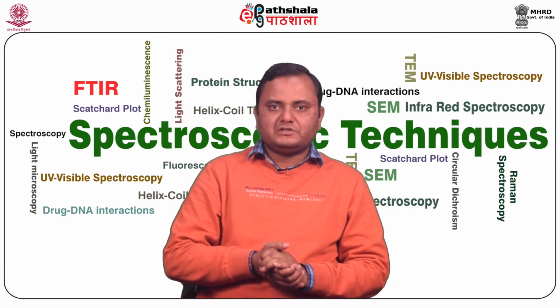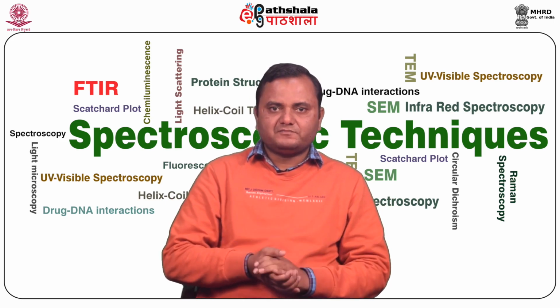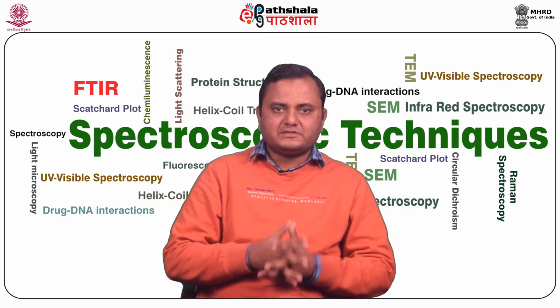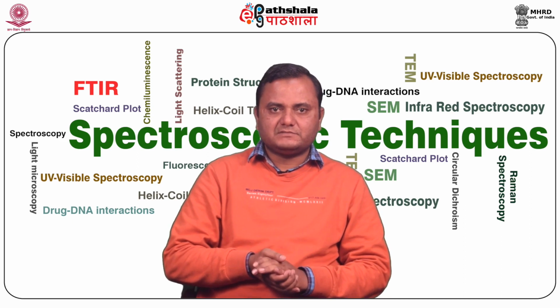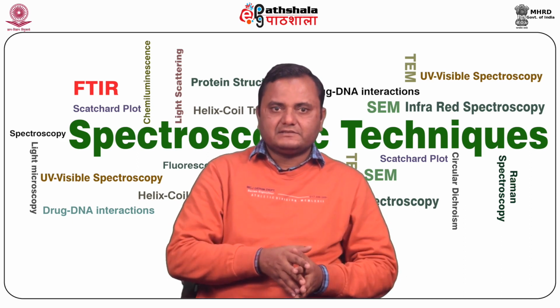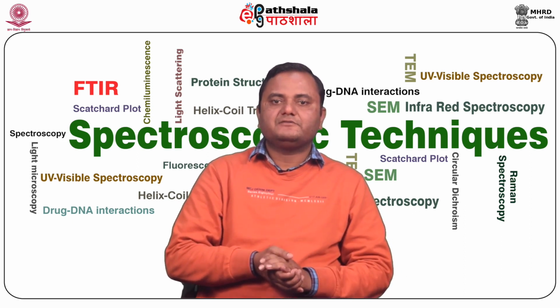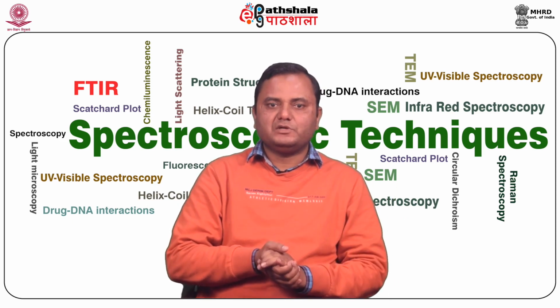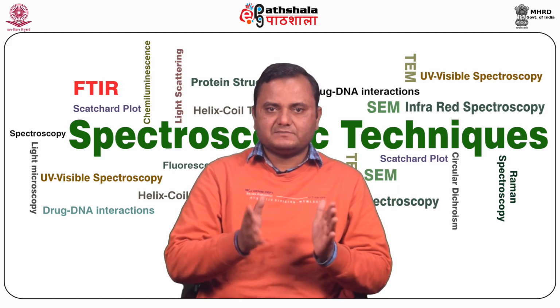At low concentration, the emission of light is uniform from the front to back of the sample in the cuvette. At high concentration, more light is emitted from the front than the back. Since the emitted light is detected only from the middle of the cuvette, the concentration must be low to assure accurate fluorescence measurement.